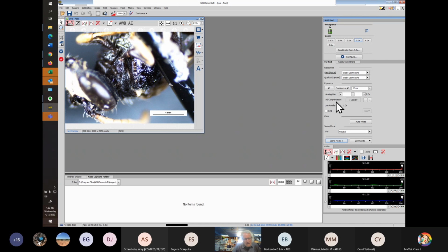Okay, so I can't get higher in terms of the magnification, but here we have pretty clearly, we're upside down, right? So there's the head. This is the mesepisternum lateral face. Anterior face is right through here. That's the pronotal lobe. This is the top of the bee here. These are the legs. And here's that big ridge. Oh, that's right. We can do full screen.